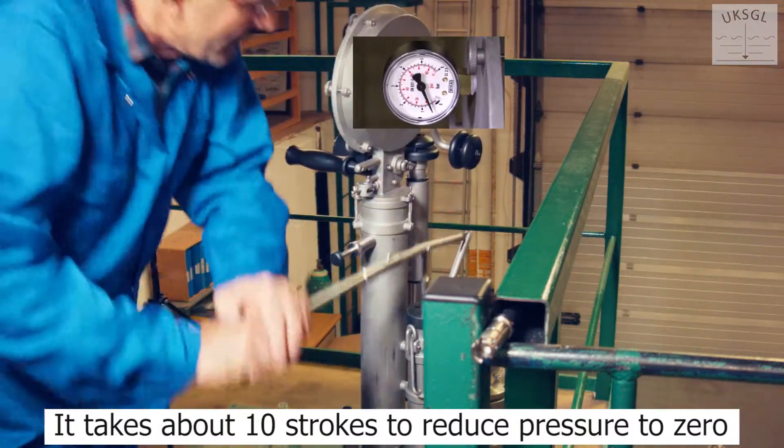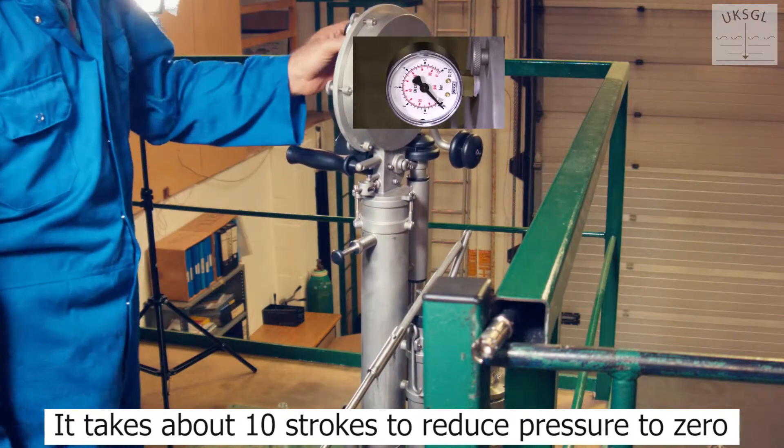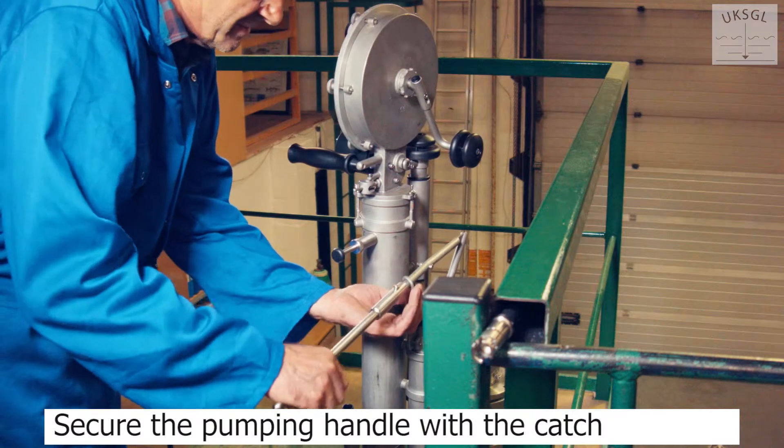This will take about 10 strokes. The gas is pumped back into the tank. Secure the handle with the catch.